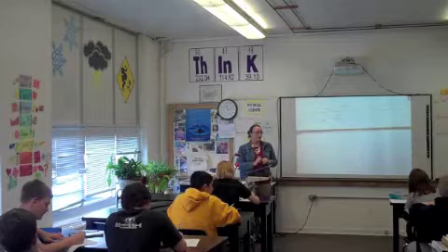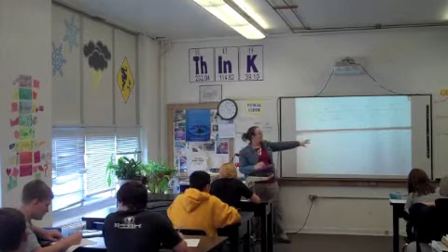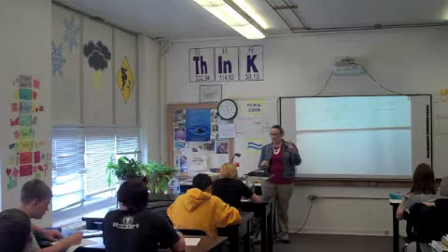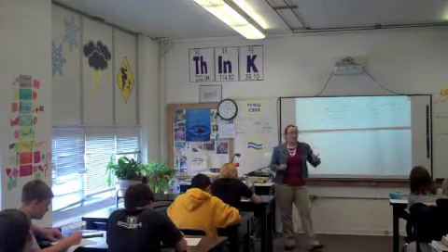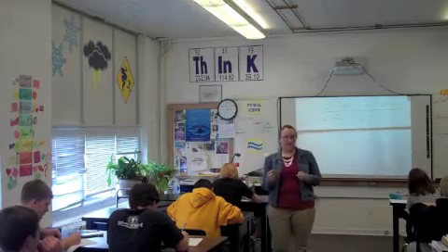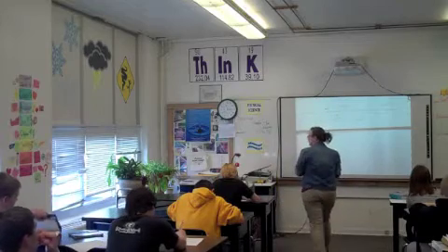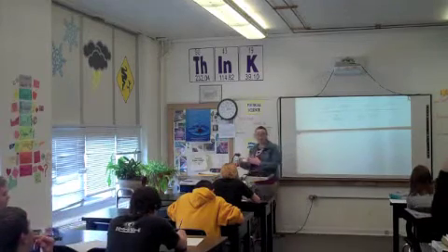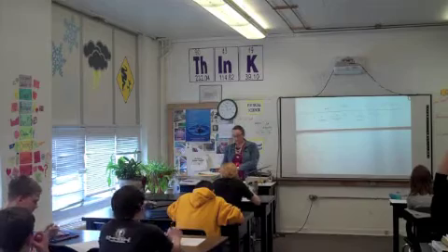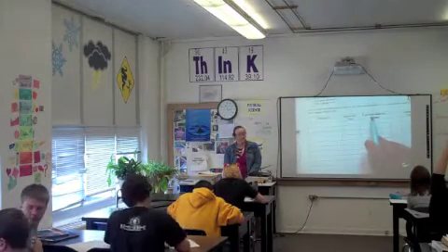Okay, so I have these ready to go in the lab, and you are going to test these with 2 different indicators. One of them is that natural indicator we talked about, the purple extract from red cabbage. The other one is similar to the pH paper. It's a chemical that's been fabricated, or a bunch of chemicals together, called universal indicator.